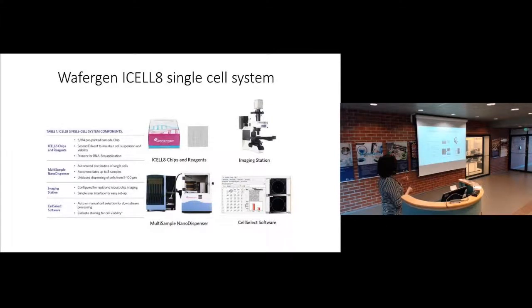So based on that, this program makes a map for the dispenser, and you put the chip back there, and then only for those wells where you have one living cell, and one only, not 0, not 2, 3, just one, it pipettes the next step reagents only to those wells. Therefore the data is quite clean, because there are no duplet wells or dead cells analyzed at all.